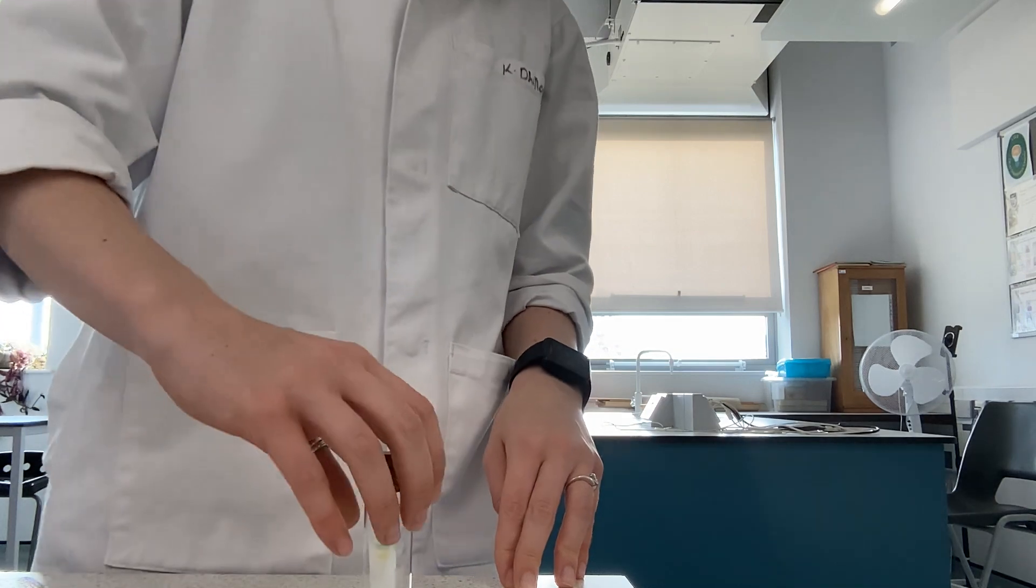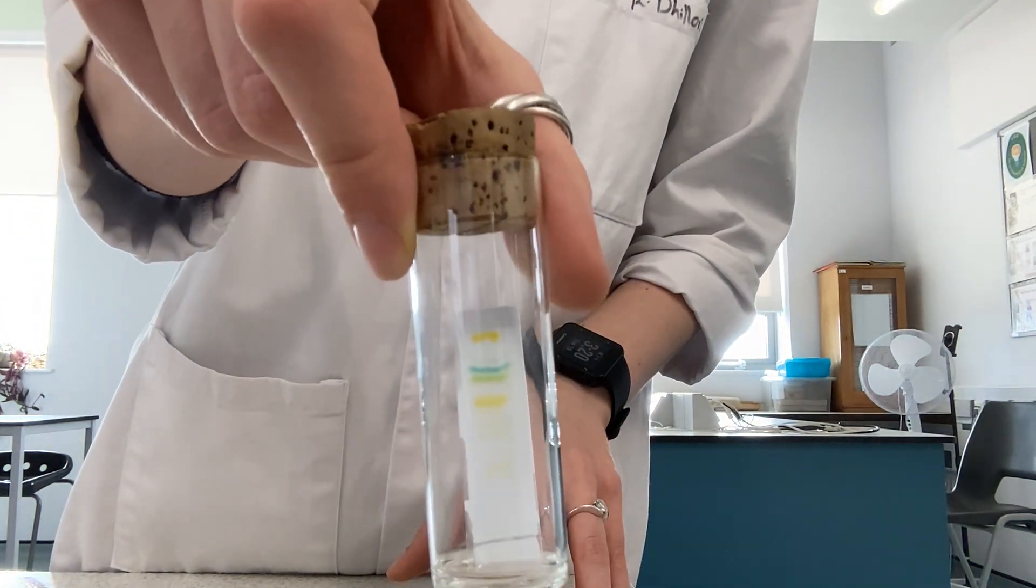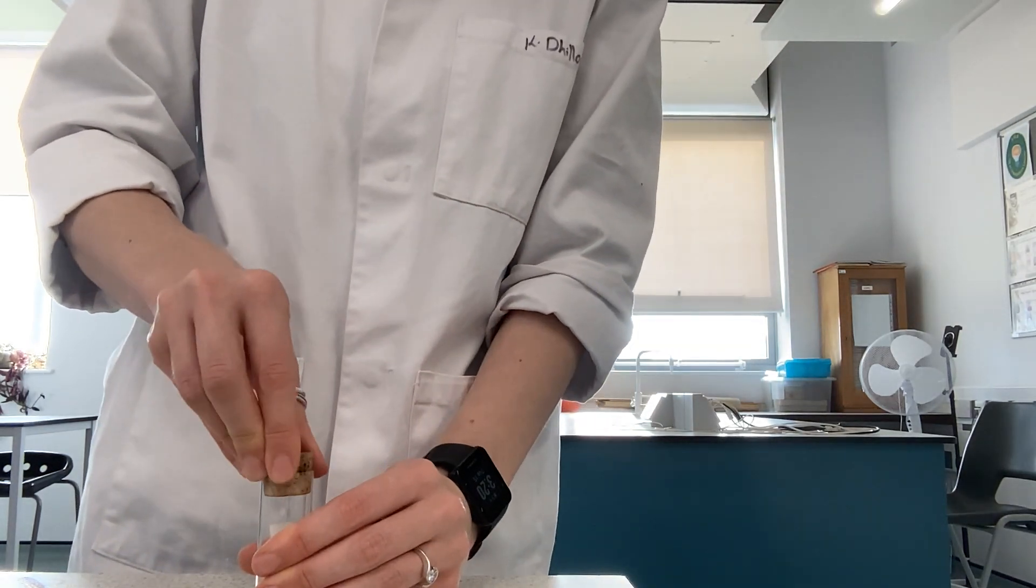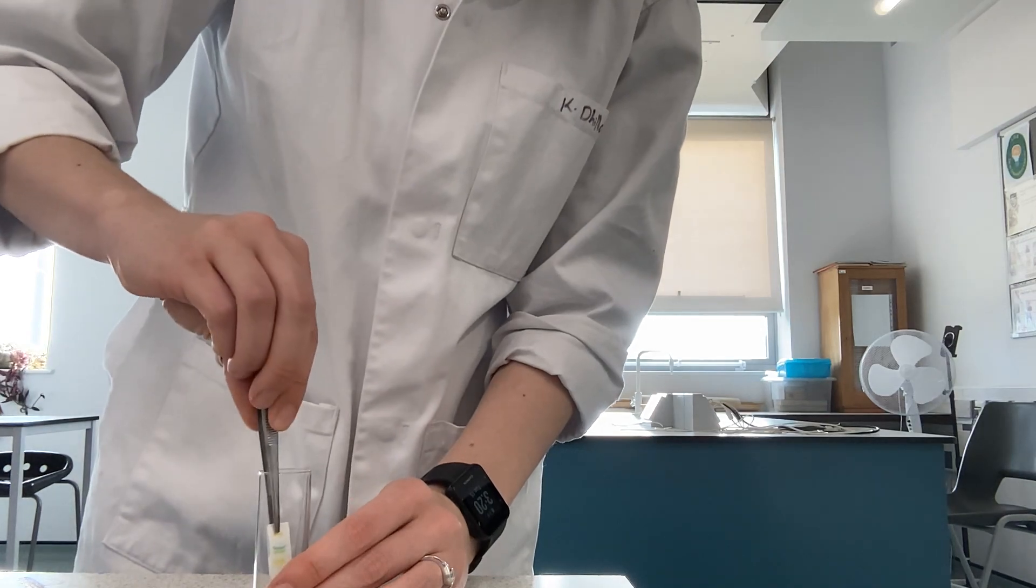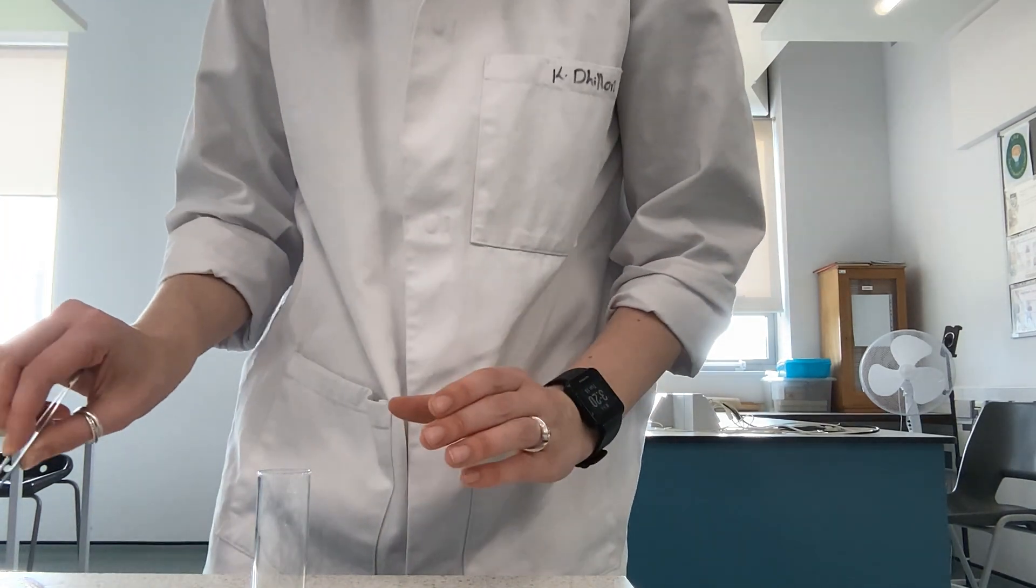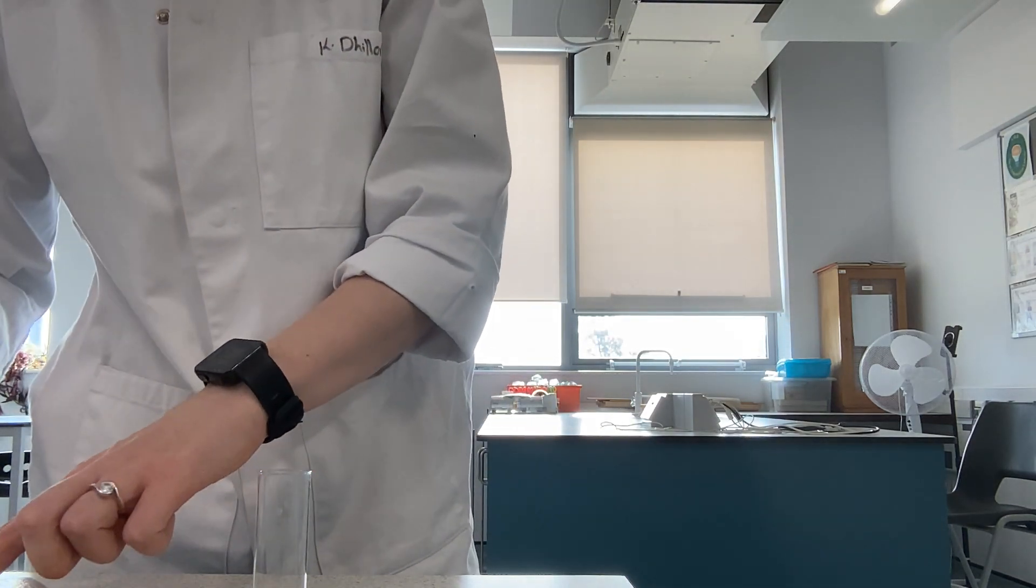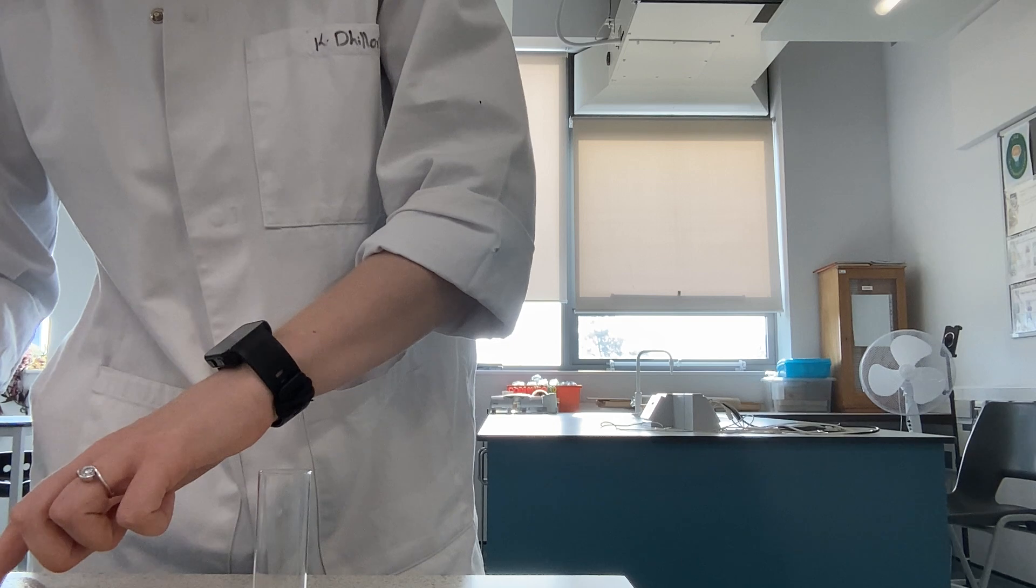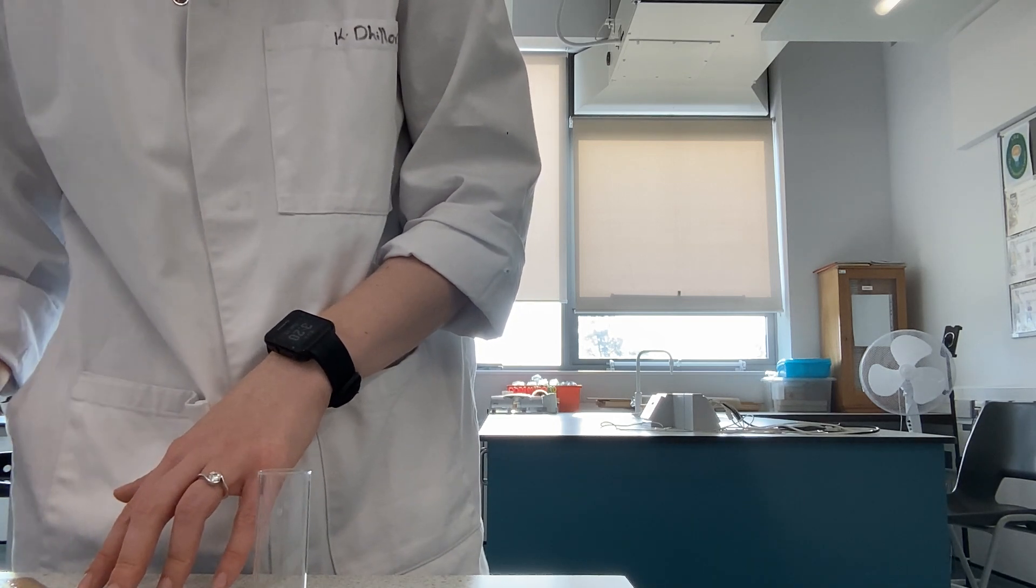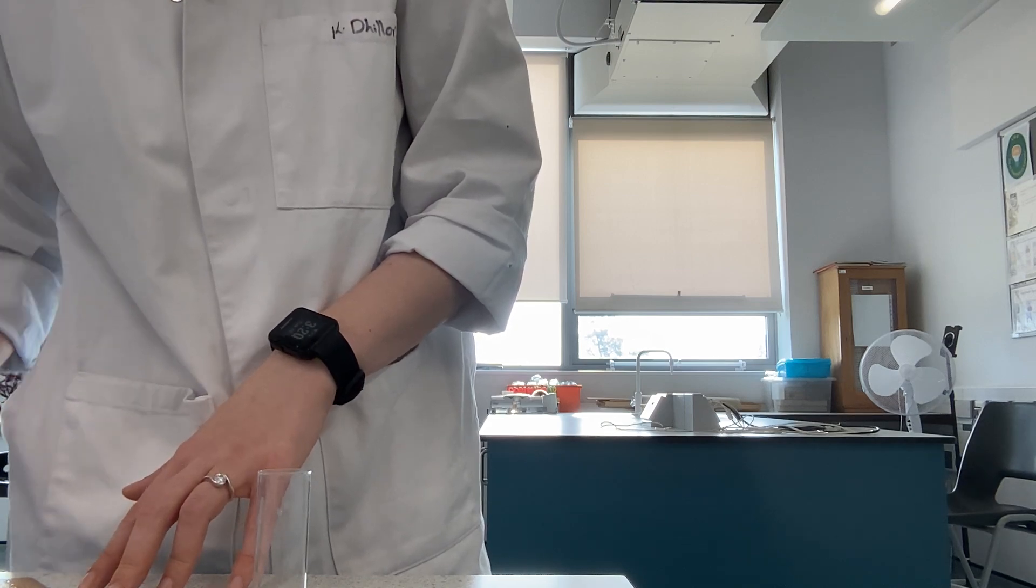Having left it to run, we can now see that the solvent front is very close to the top, so it's time for us to take it out. We'll just use some forceps to take our TLC plate out, and then what we'll do is place it down next to a ruler so that we can then do some measurements. We'll take a photo so that we can come back to this at a later date and do a whole range of measurements from there.